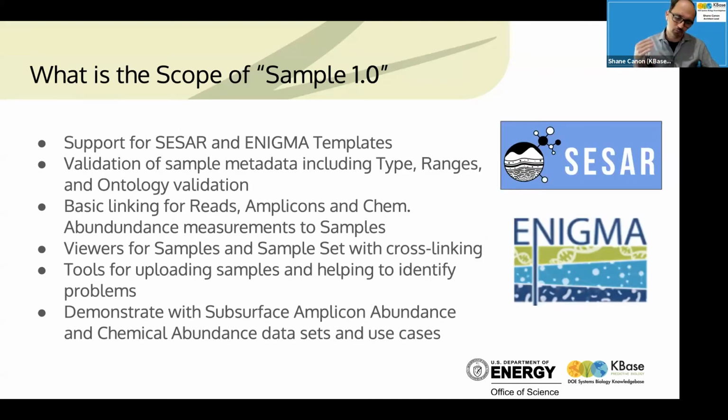So Paramvir talked a lot about the ambitions we have around samples, and there's a lot that we eventually want to do with it, but this is just the first baby step in being able to deliver those capabilities. So, this is samples 1.0. I'd say it has enough features to do interesting things, but it's not going to necessarily be able to solve everything you want to be able to do in samples and analysis today.